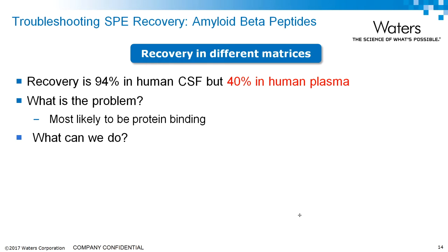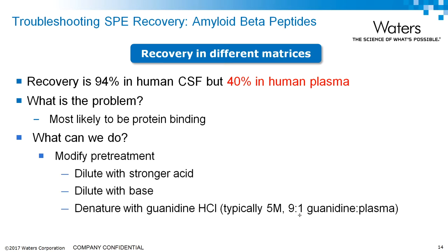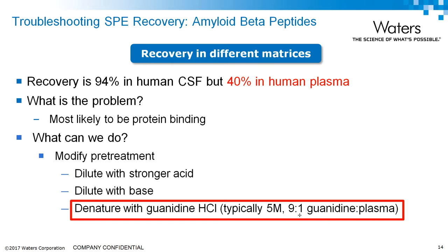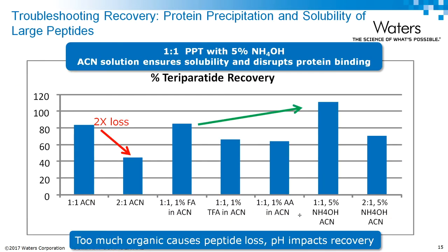For that same amyloid peptide, we saw high recovery in cerebrospinal fluid, which is a low protein content matrix, but very low recovery in plasma. The major difference is the protein content. What can we do? Modify the pretreatment. In this particular case, the only option that actually worked was a full denaturation — so sometimes you need to resort to extreme measures.